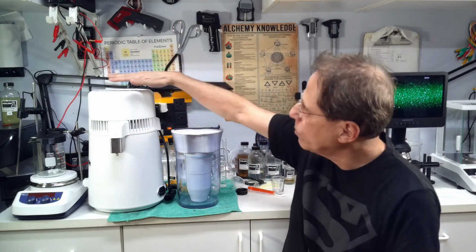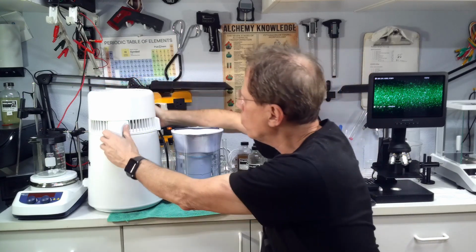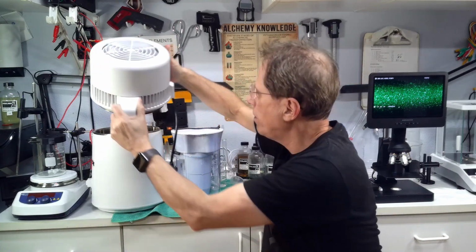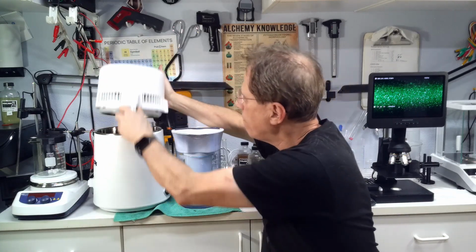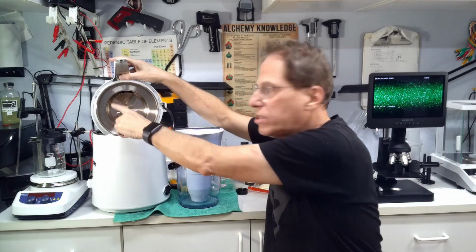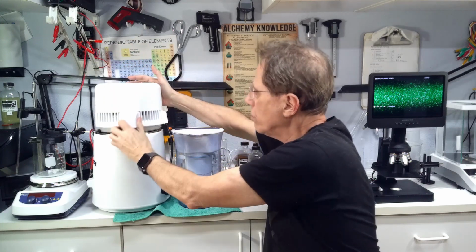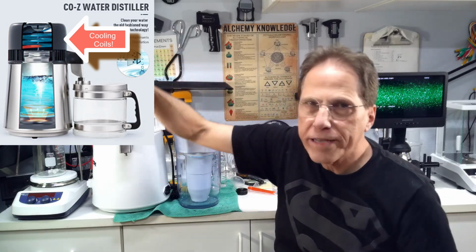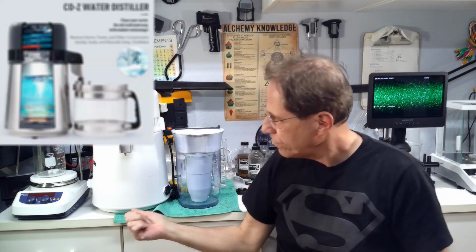Mostly 0 parts per million water can be achieved through distillation. This is a distiller. You put the water in here, and then you plug it in and it boils. It goes into the top here. You look on the top, you'll see the steam goes in here, goes underneath this flap, goes into the coils, which are all wrapped around on top here. And then the fan cools the water down, and then it drips down the coils into your water tank.